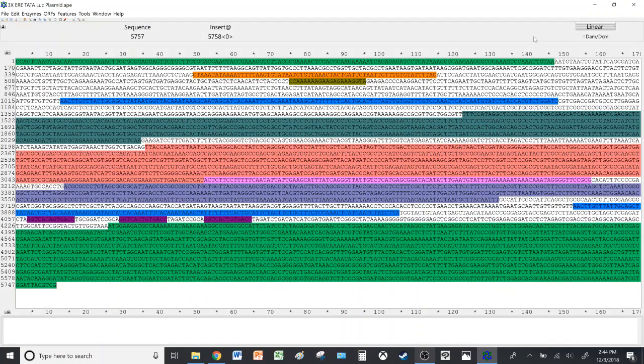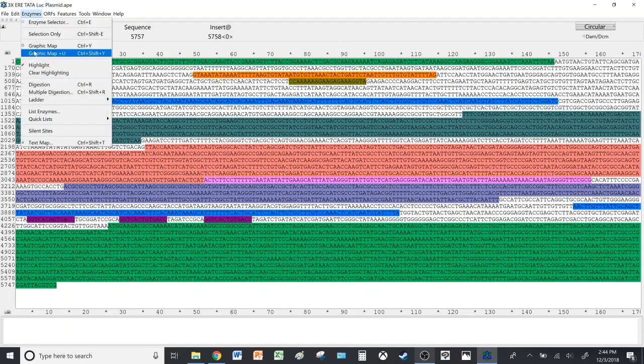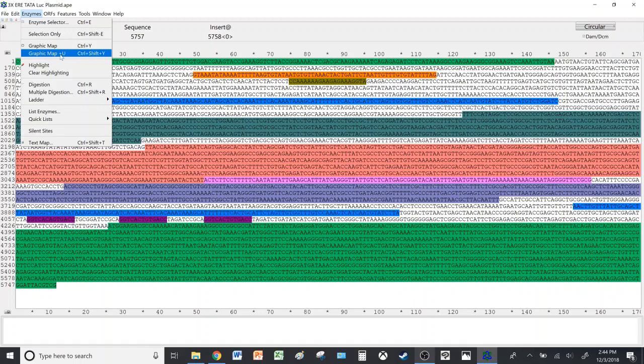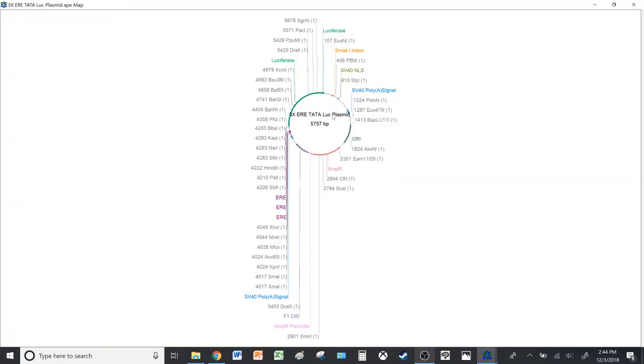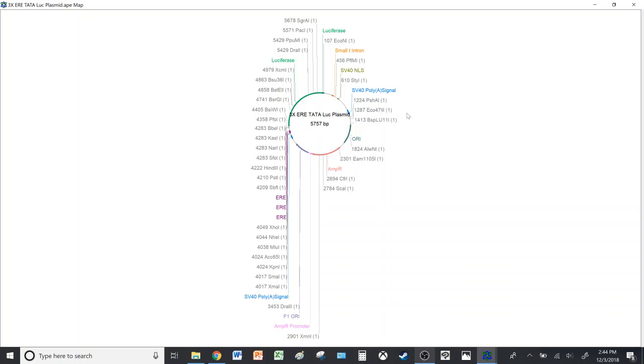Whichever mode is convenient for you, you can go ahead and use that, but we'll keep it circular for the remainder of this video. Now let's take a look at another Graphic Map Plus Enzymes. This shows you all the restriction endonucleases that have cut sites present on the plasmid sequence itself. As you can see, because there are a lot of enzymes, the diagram shrinks a bit.